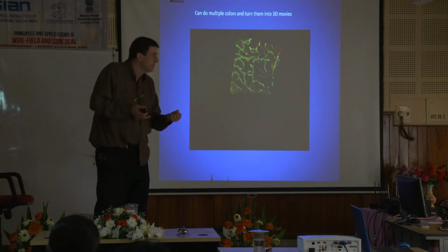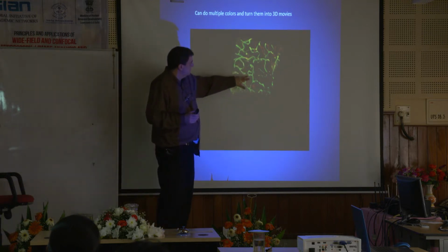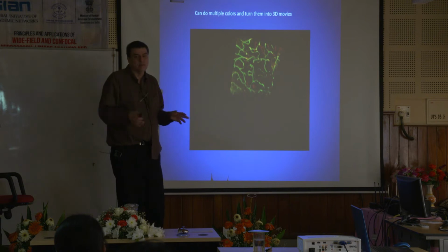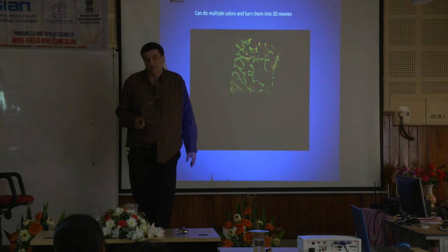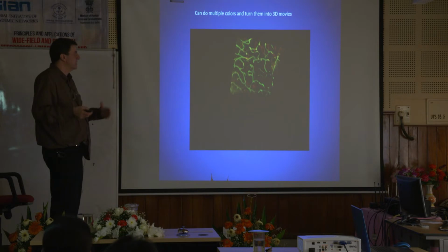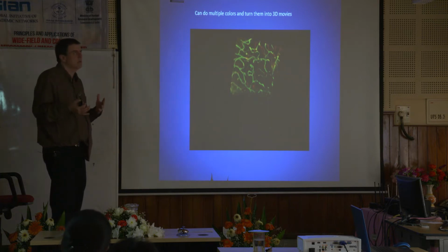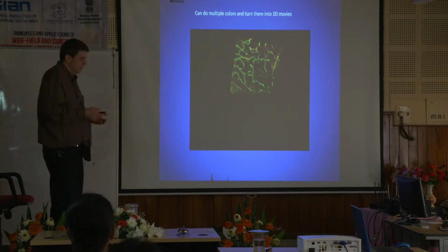They are closed off. So green shows where all our live vessels are, and then we go back in with the counterstain that just stains the vessels in general. So by subtraction, the red is the dead vessels and the green is the live vessels. So pretty cool technique. Fluorescence doesn't just show live things, you can use it for dead things. You just have to think it through. What do I want to look at? How do I want to look at it? Use your 2 colors in an effective manner, or 3 colors or whatever.